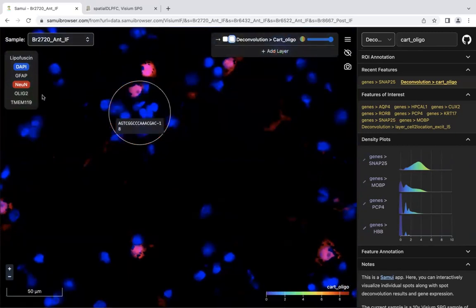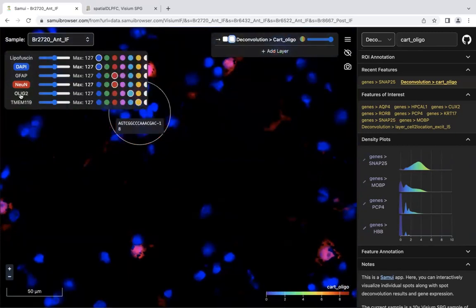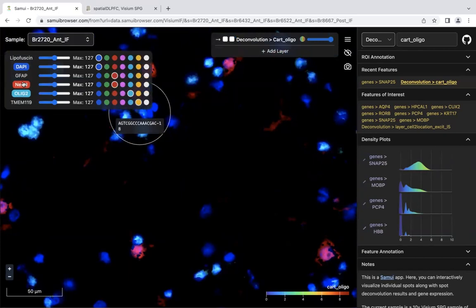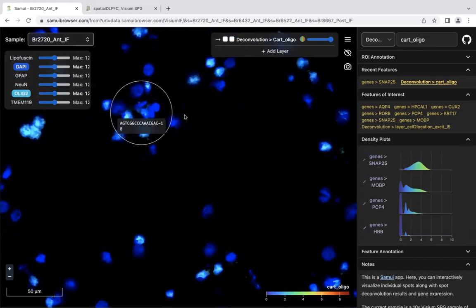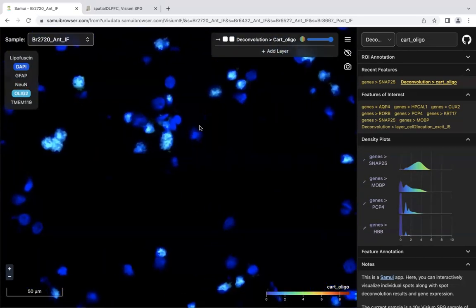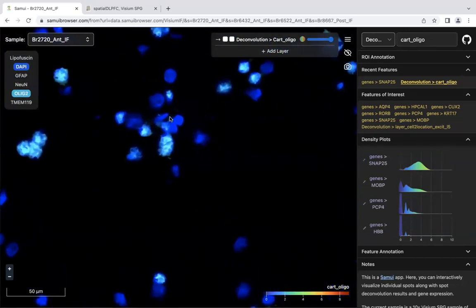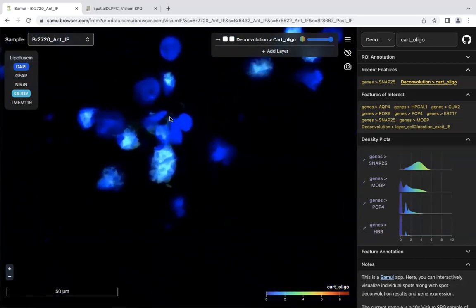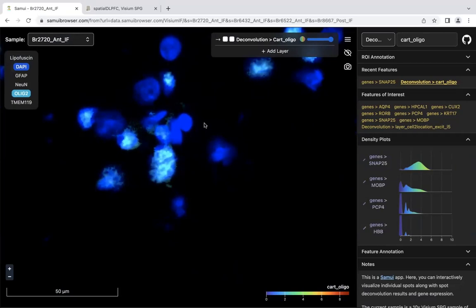We can select the olig-2 fluorescence, which is what really marks for oligodendrocytes, and see what's going on in the cell. We do see a lot of these cells have olig-2 fluorescence, leading to higher counts, but it looks like not all of them.